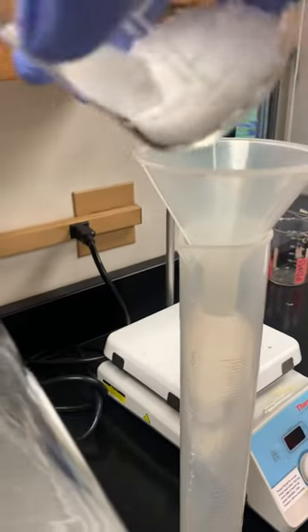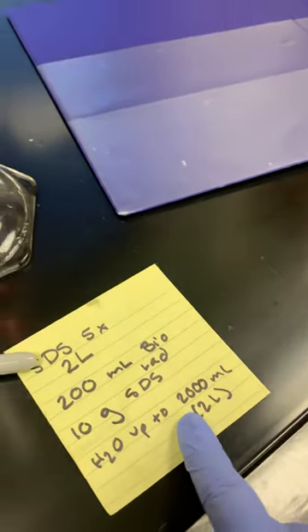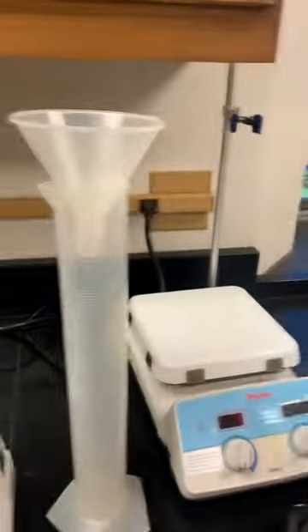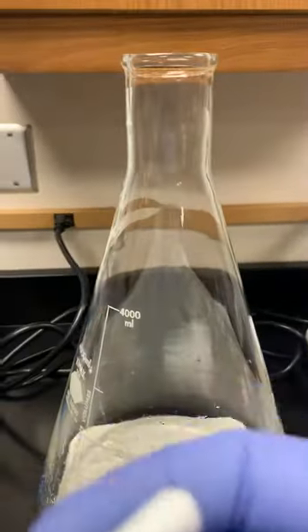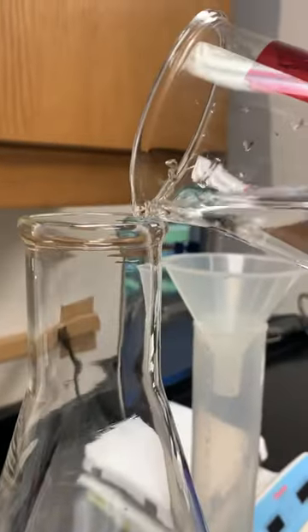I don't know if we need the funnel for that one. So this is what it looks like. Then it says H2O up to 2000. I pre-filled some water — do not add your stir bar yet. Your stir bar has volume, so I'm going to pour this in.